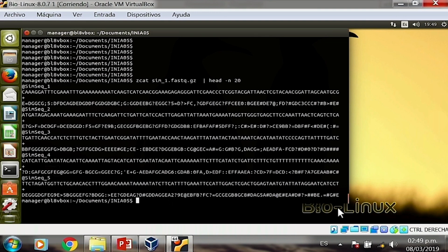But this is actually a way that Illumina, and most people who use FASTQ, use to codify the quality of each of the bases. For each base that you have on the second line, you will have a character on the fourth line. So the second and the fourth line will always be the same length. They'll have the same number of characters. Why? Because for each nucleotide on the second line, you will have an associated quality value.